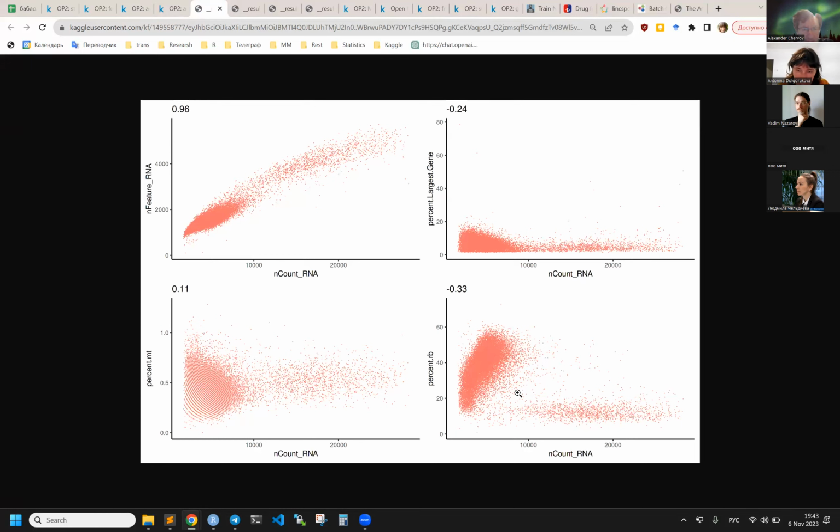And that should be the same cluster we see. I think so. We will see further when colored by cell type. Maybe we can just come to the next. Okay. Anyway, this percent of ribosomal, yeah, and a different cluster here.